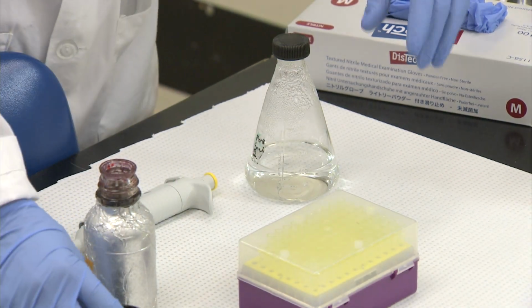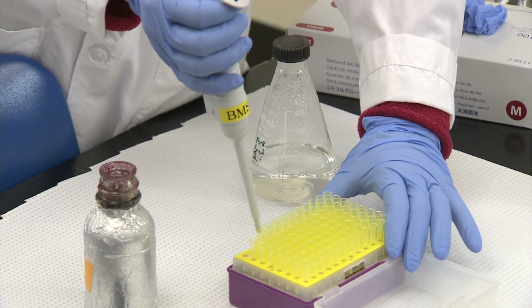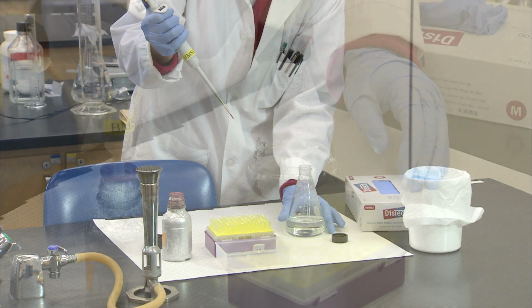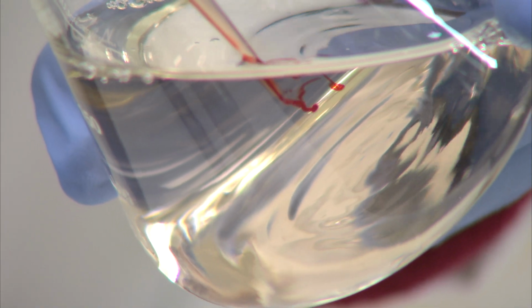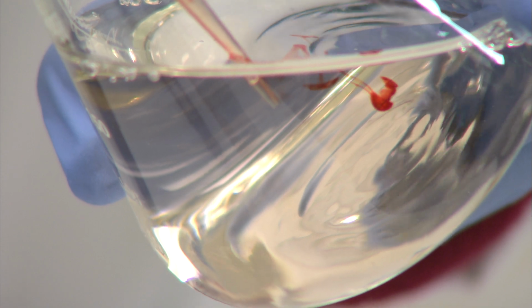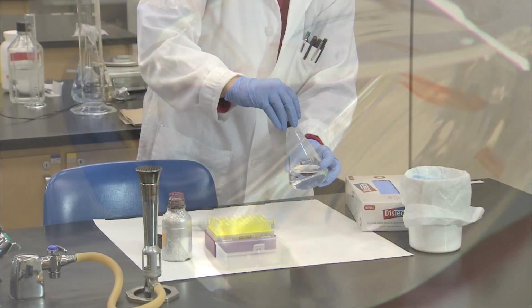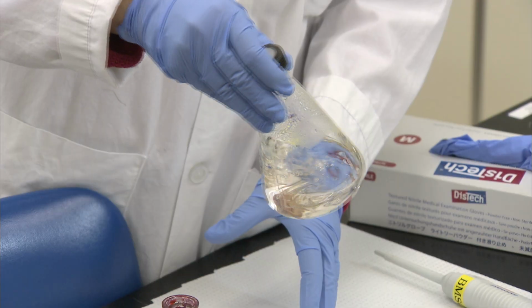In order to see DNA in a gel, it must be stained. Commonly, this is done with a carcinogenic chemical called ethidium bromide. To make a stain-containing gel, the ethidium bromide must be added while the agarose is still molten. The sample is once again swirled to get consistent distribution of the stain in the gel solution.